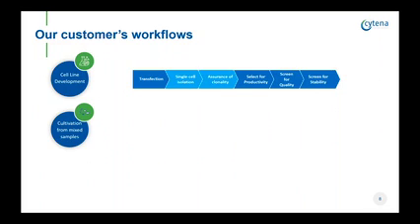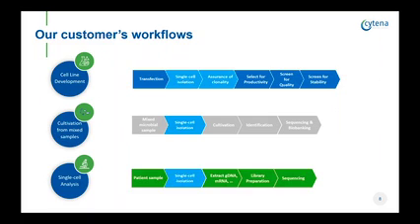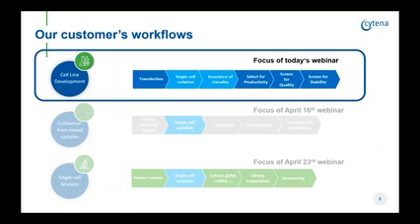Another application we are focusing on is cultivation from mixed microbial samples. Typically, this starts with a heavily heterogeneous sample. And the third application is single cell analysis, and most prominently single cell genome and transcriptome sequencing. Today, we will focus on cell line development, and there will be 2 more webinars next week and in 2 weeks on the other 2 application areas.